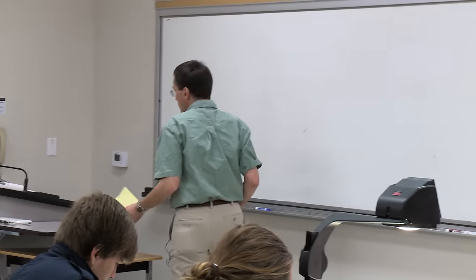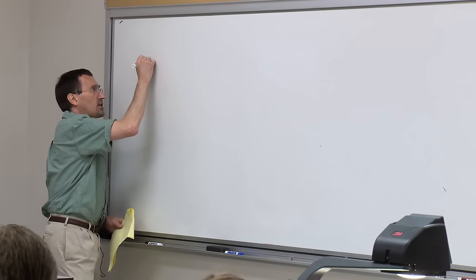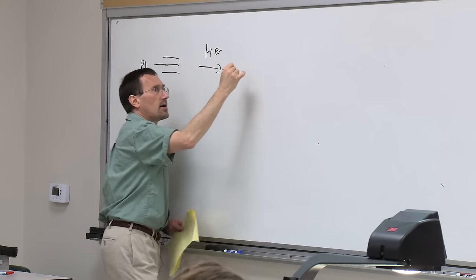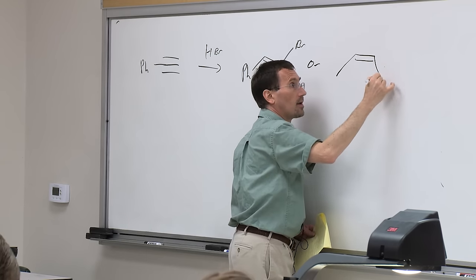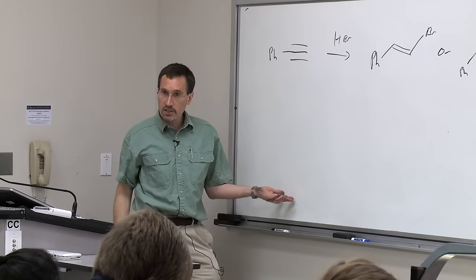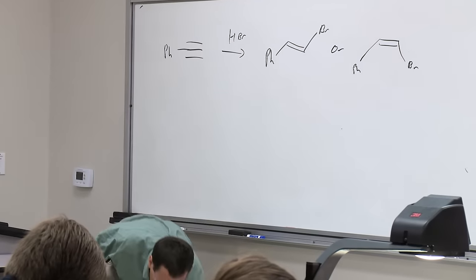All right, now, why is this useful? Why are we talking about this? Well, there is information that you can get from coupling constants, from coupling patterns. So imagine for a moment that we did the following reaction. Let's say we had phenylacetylene, and we treat it with HBr, and we get bromostyrene, but we want to know if we get cis or trans or a mixture. This is a perfect question for NMR spectroscopy because the coupling constants are going to tell you the answer.